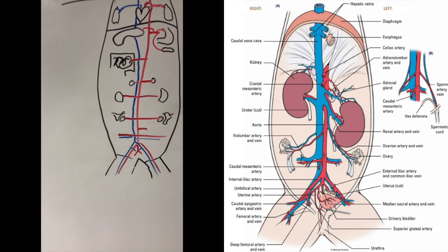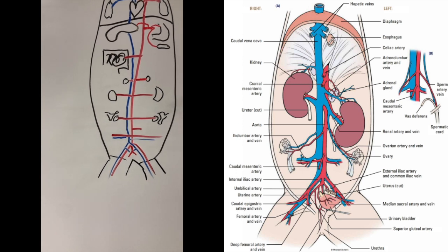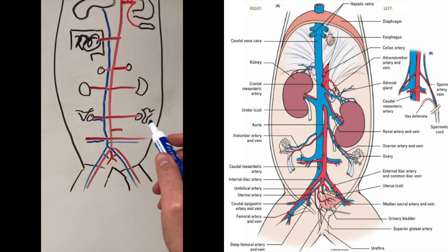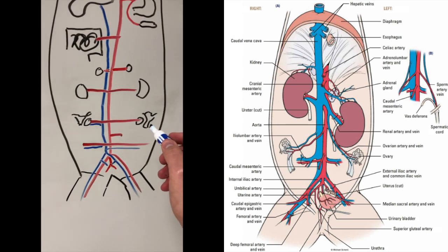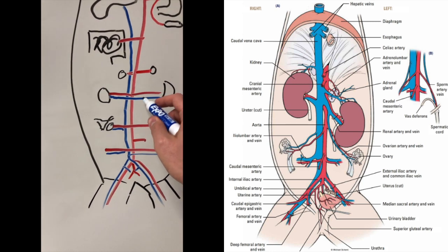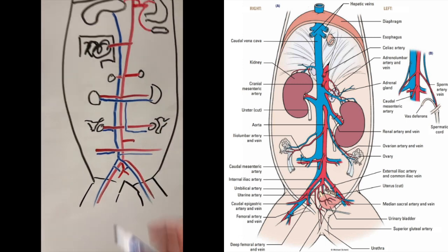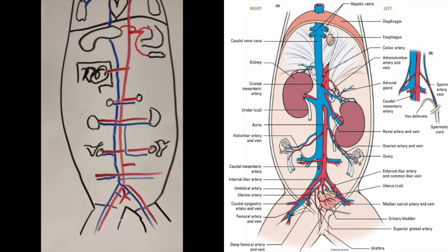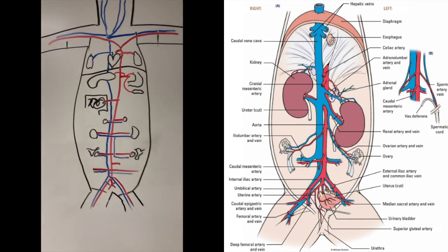We do have a left and a right gonadal. The interesting thing about the Mink, and especially the left ovary, is that the left ovarian vein actually drops off of the left renal vein, drops down like that. So it's interesting. And there's a left and a right adrenal vein. And now we get up into some interesting territory as we head back north again.